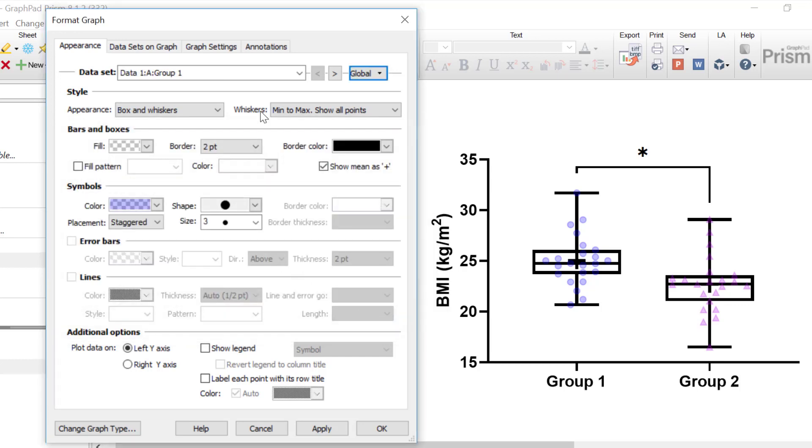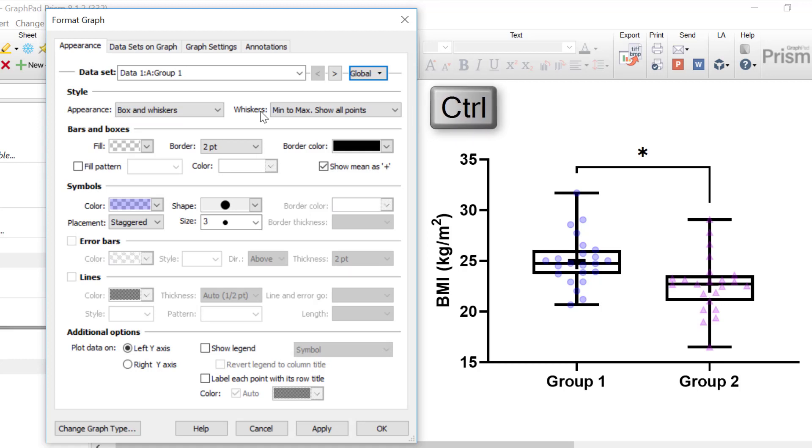Finally, a quick and easy shortcut to changing the global settings is to press and hold down the Ctrl key on your keyboard while the Format Graph window is open. Notice that the globe icon has appeared.